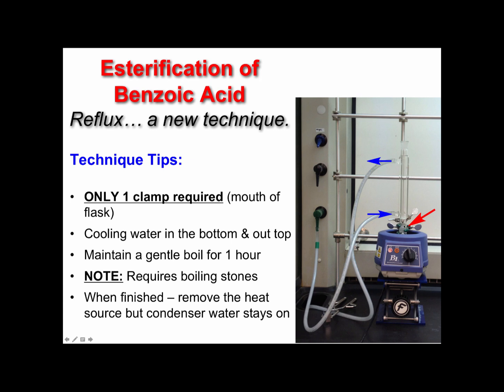It should stand up firmly without sitting in the heating mantle, because later on you're going to have to drop the heating mantle down, and if this is not clamped well, it will actually fall down. And it could break the glassware and destroy your reaction mixture, and you'll have to start again. So please be very mindful of the clamping.